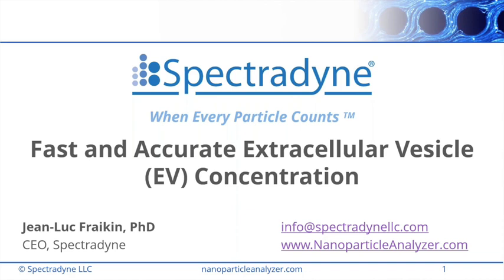Thank you. There's another question. It says, when calculating the EV concentration, should you include anything down to the lowest range of your instrument? So, Jean-Luc, again for you, I would believe. Well, maybe this would be a good one for Dr. Welsh, actually, talking about the limit of detection and including that in the measurement report, or the reported concentration. Yeah. Josh, are you available to answer that one? Yeah, sure. So the limit of detection.